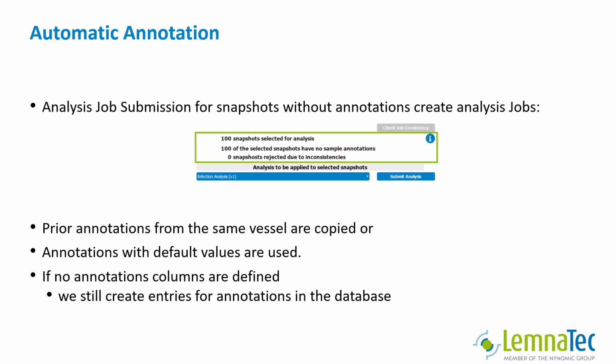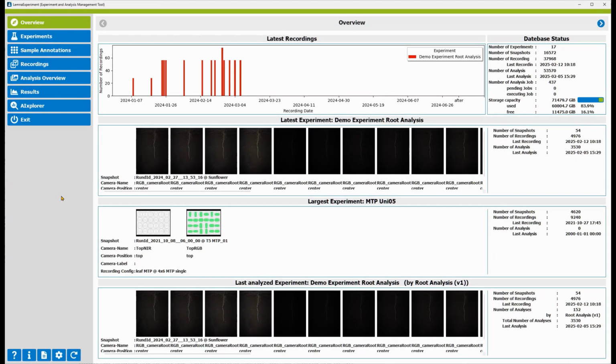This is of course only an issue if you have analyses for multiple samples on one vessel in the first place. But there's hope. LemnaExperiment has some options to correct this. However, I will explain them in another video. With all this background knowledge, we may now look into the software and how everything is handled. First, I like to handle the manual case.